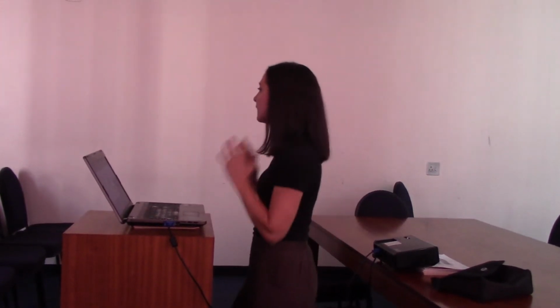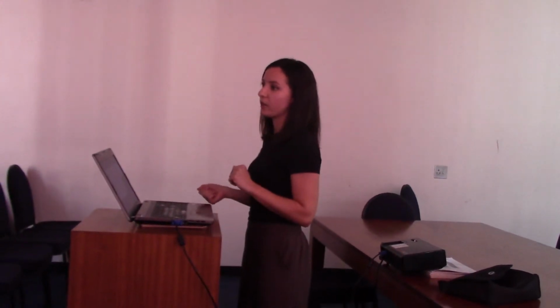So the success of your RNA-seq experiment is dependent on your pure and intact RNA. At the end of the day, we always say crap in, crap out. So make sure that you have good quality RNA from the get-go. Act fast. Be cognizant of the fact that there are RNases everywhere. You need RNase-free tubes, RNase zapper, inactivate your RNases, work in a clean hood. Just make sure you're stabilizing your RNA. RNA can be very problematic to work with.